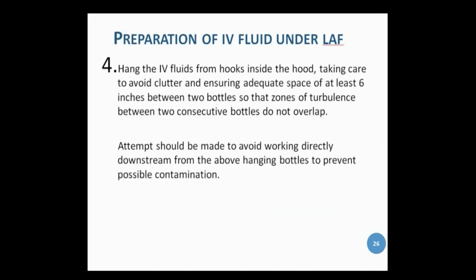Step number 4. Hang the IV fluids from the hooks inside the hood, taking care to avoid clutter and ensuring adequate space of at least 6 inches between two successive bottles so the zones of turbulence of one doesn't overlap with the other.